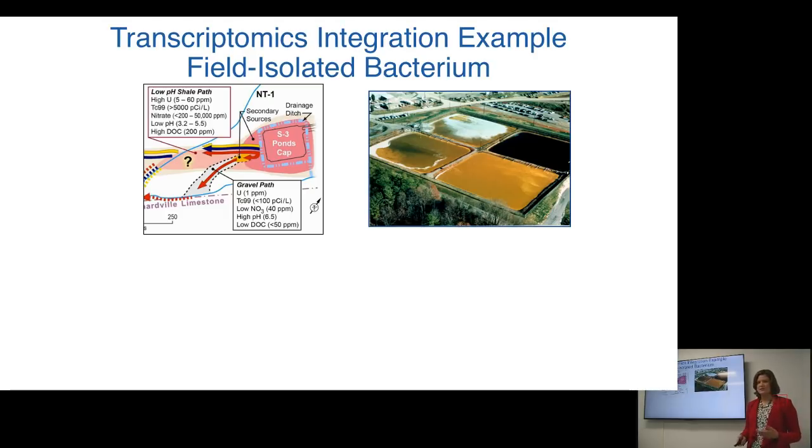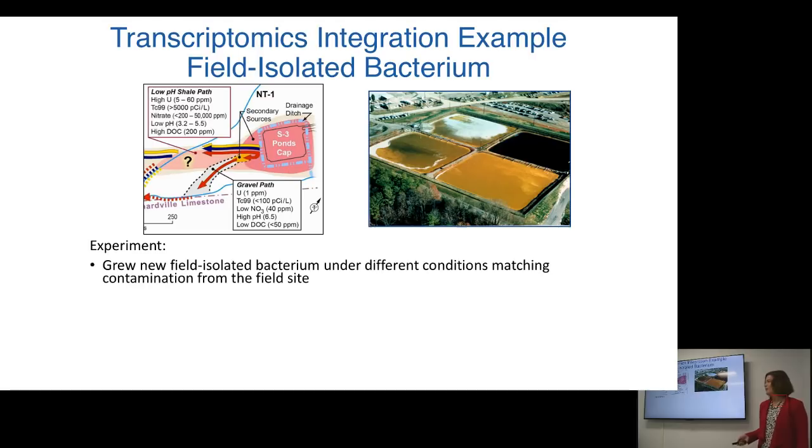So we really want to be thinking about how do we remediate that groundwater, how do we understand it. However, these environmental systems are incredibly complex, and there's many multivariate factors, and so we've started to use omic technologies like metabolomics and transcriptomics to understand the flux of these contaminants and how the microbial communities that naturally exist there are responding to these contaminants, and how we might actually be able to use them to remediate them or to move that. And so therefore metabolomics is helping us understand their metabolism.